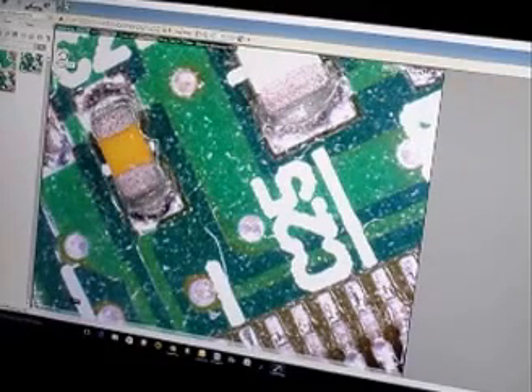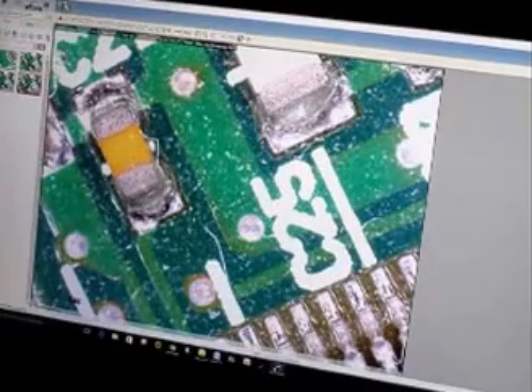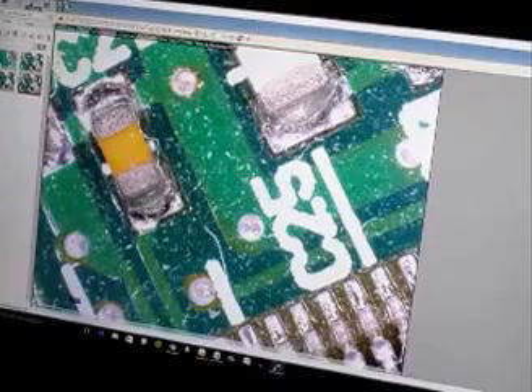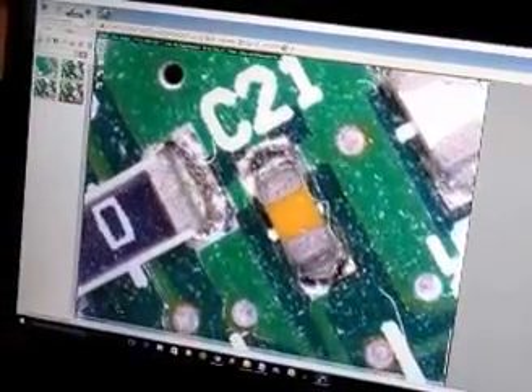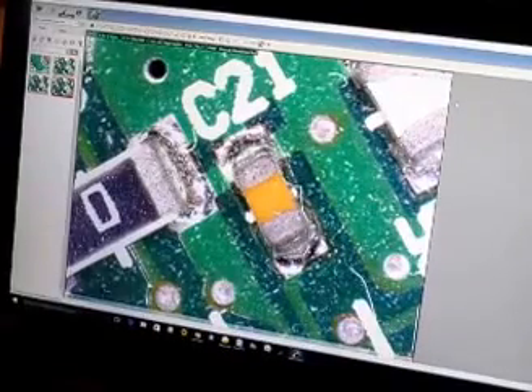You see that icon right there on the screen — just click on that to take the picture. Another little thumbnail shows up on the side and it'll save all the pictures you take. The default image file was BMP and I changed that to JPEG — otherwise we're shooting with the defaults. I've only got it on about 100x right now, so that gives you another idea of what it can do.